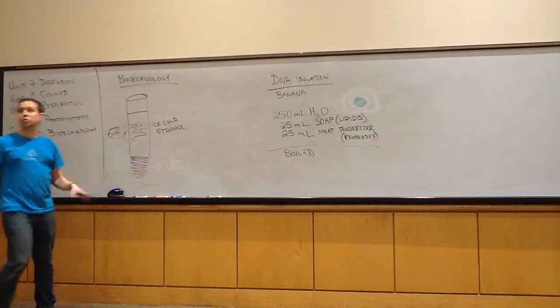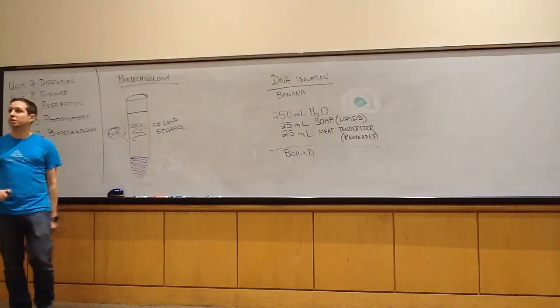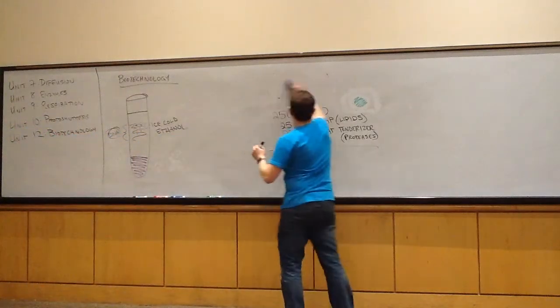This is very rudimentary, but it is still used in a similar fashion today. This is the technique that is ultimately used to isolate DNA. Okay, so we've isolated our DNA, now what? Well, I'm glad you all asked.